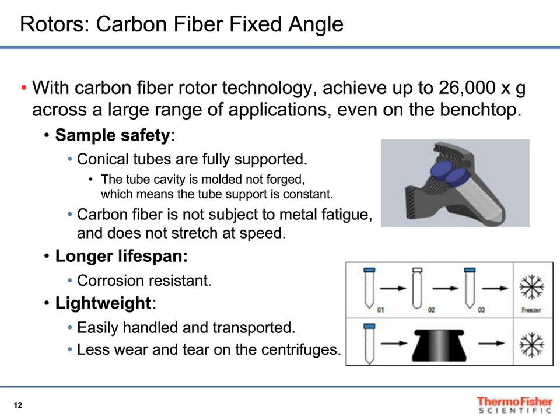Just as soon as they're done, they open it up, throw in some new samples, and go again. And when you have to watch that, because sometimes you'll see a temperature rise over time as the chamber tries to warm up, given that hard usage. But basically, they do that.